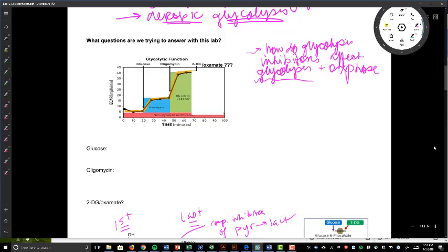However, what's a little more up for debate is how do these inhibitors affect oxidative phosphorylation? And because these two inhibitors affect different steps of glycolysis and have different mechanisms, do they show up differently when we monitor in-cell inhibition by Seahorse? Do these two inhibitors affect cellular metabolism differently?